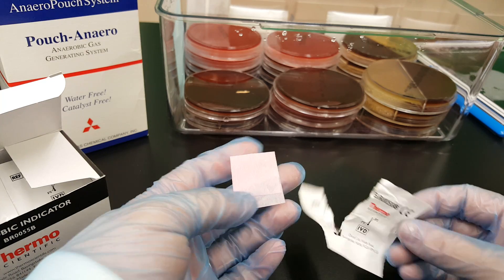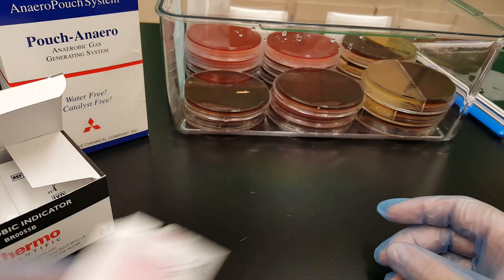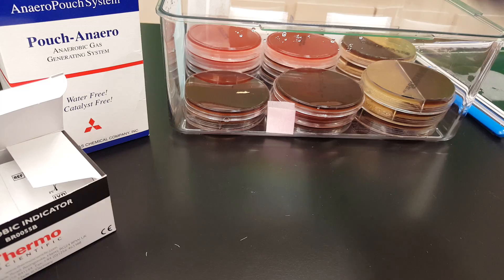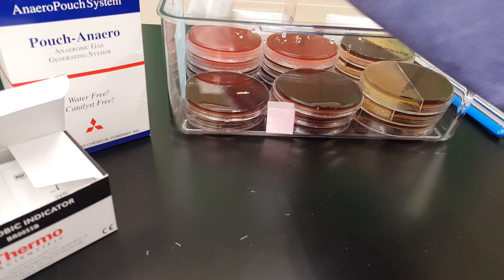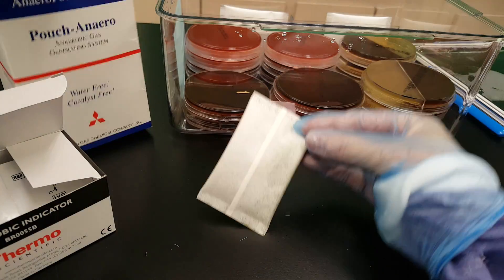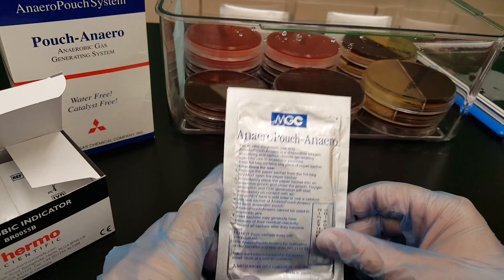If it does not turn pink, that means that you need to reseal the container and try again. So you would put one of these indicators in there, and you would put the gas packs in there by opening one of these sealed containers.